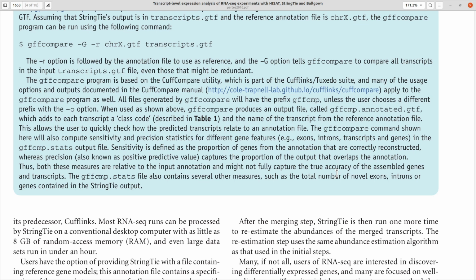So just make sure you explore. Usually for some of these tasks, you need to explore, you need to read papers and all that before you are able to arrive at the answer or the results that you want. And that is what this tutorial is about, to give you that introduction so that you can start doing your own stuff. Okay, perfect. So let's proceed. We are done with the comparison.